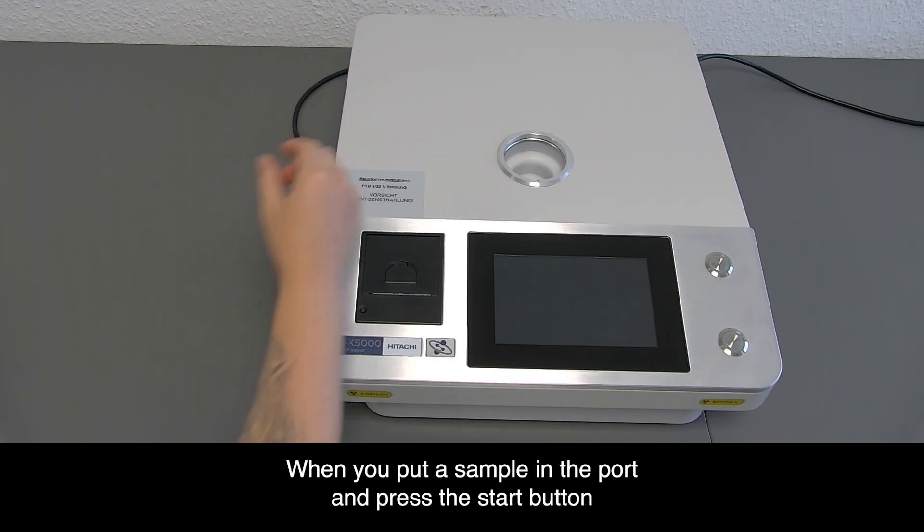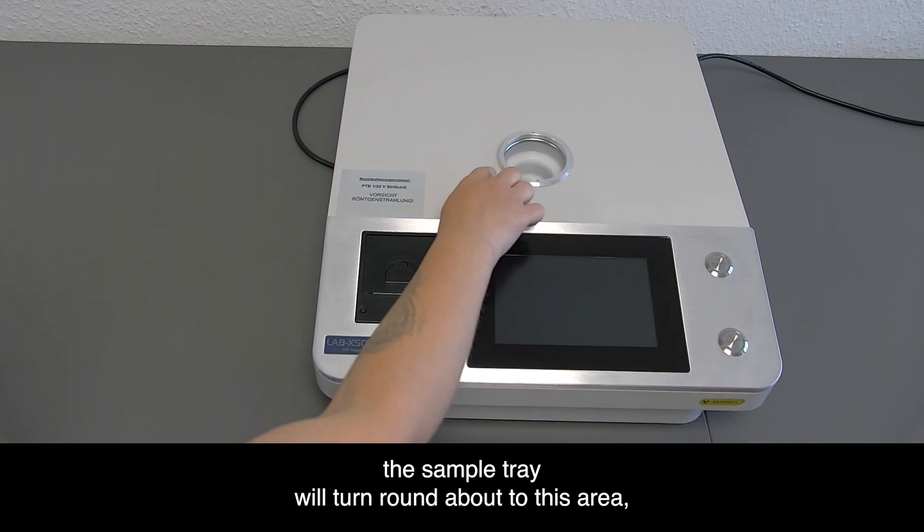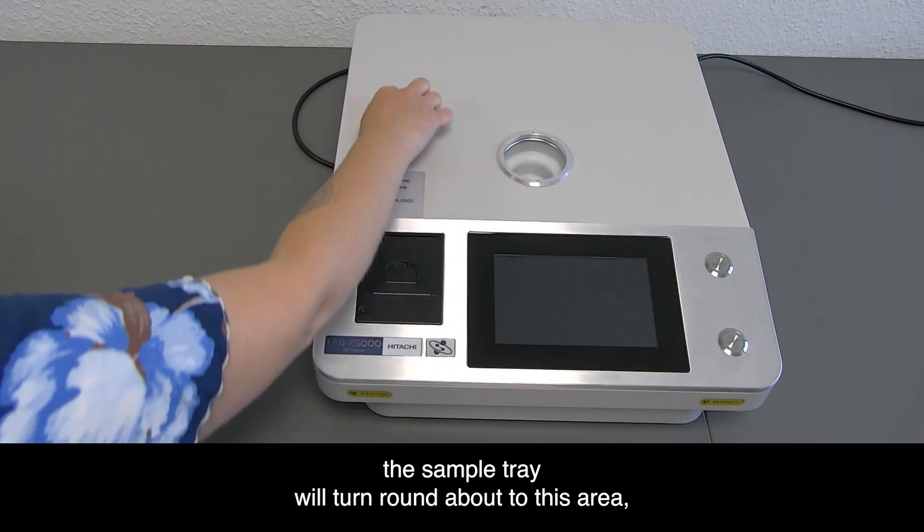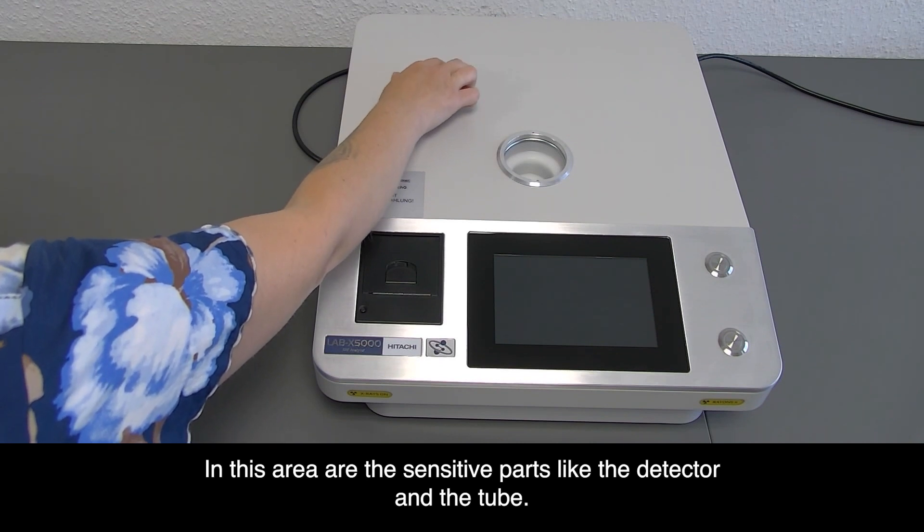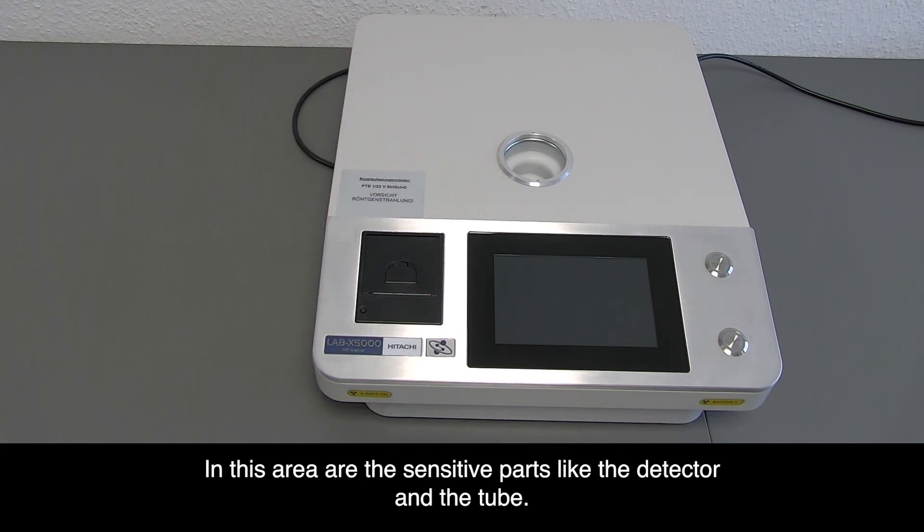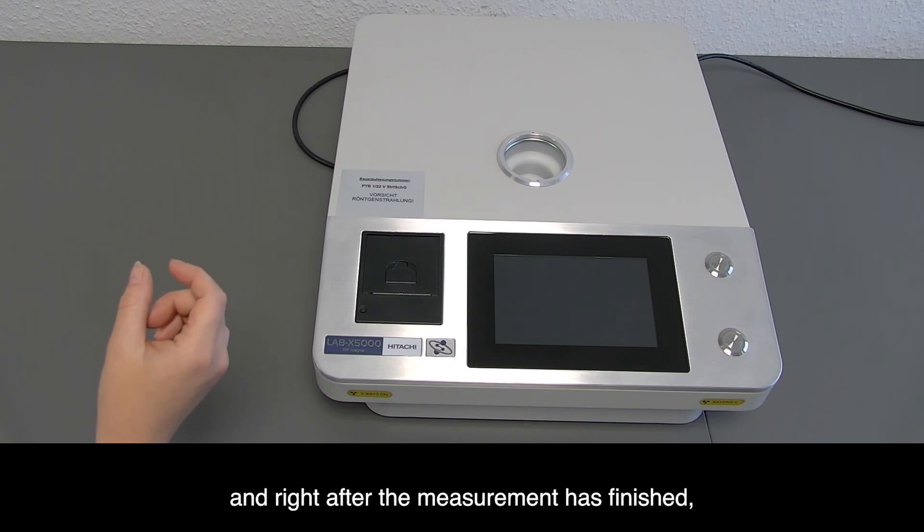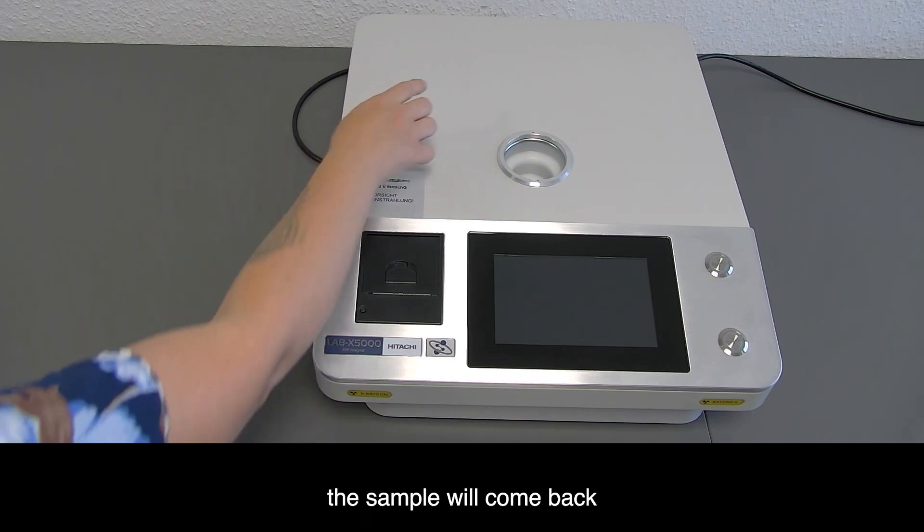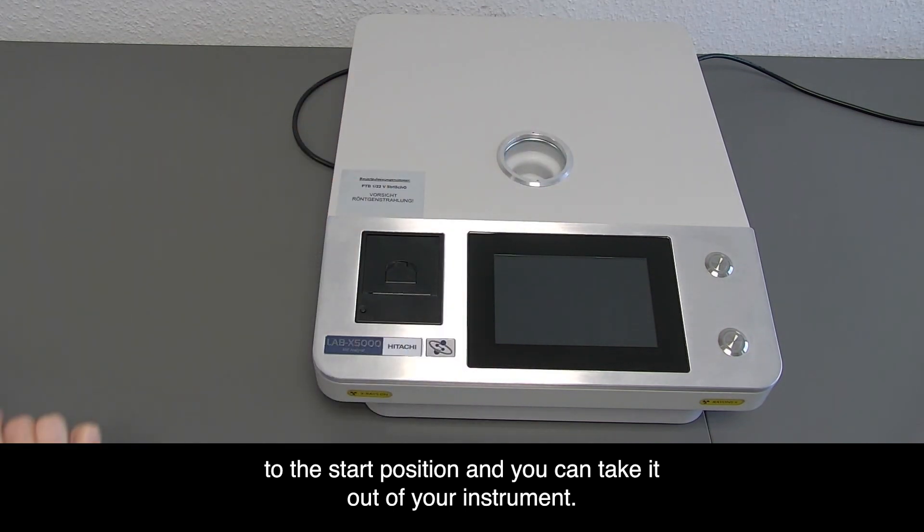When you put a sample in the port and press the start button, the sample tray will turn around to this area. In this area are the sensitive parts like the detector and the tube. Only during the measurement the sample will stay in this position, and right after the measurement has finished, the sample will come back to the start position and you can take it out of your instrument.